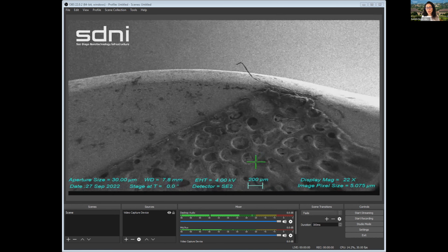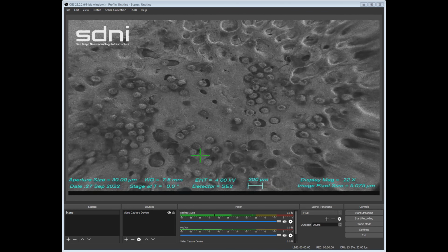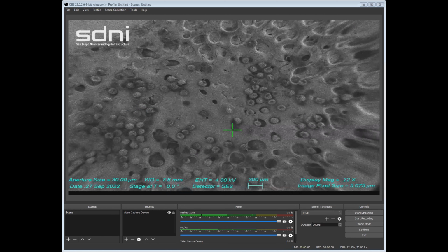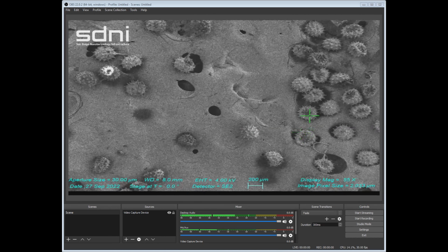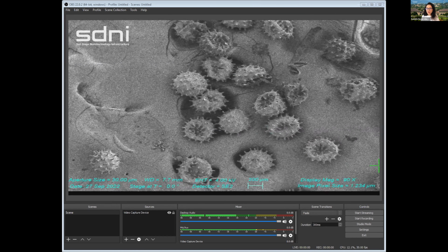And how did that work out for you? Was it through the internet, the way that Lauren had described, where you don't have to download software? Yes, it was. He let me control the imaging and it was a graphical user interface. So I could see how to manage the control and how to zoom on some zones, how to measure the feature size, how to focus on some zones of this image. That's wonderful.